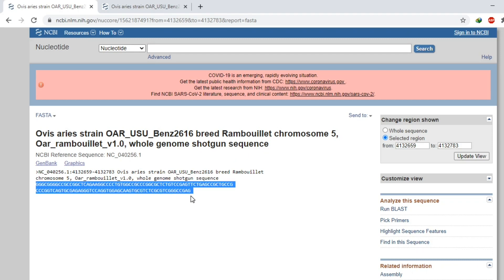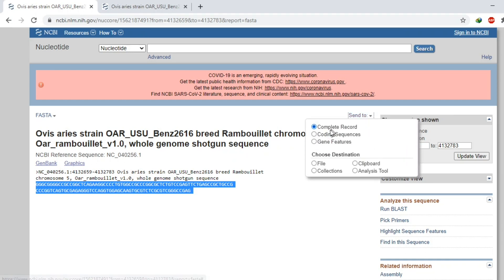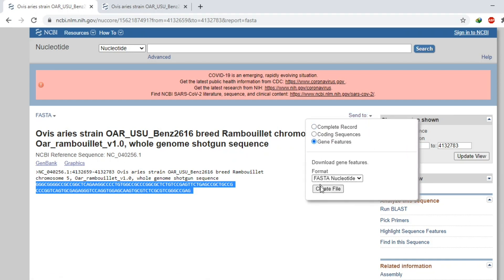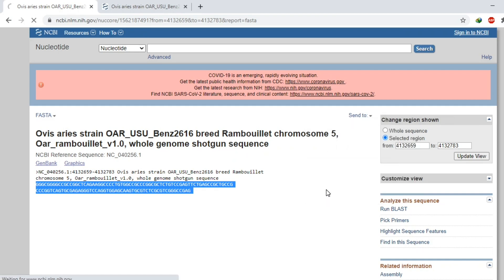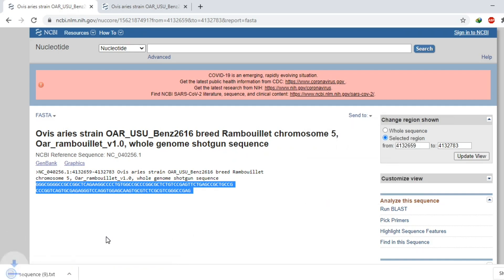You can simply copy this sequence and paste it into a Word file, or you can repeat the same procedure I showed earlier: click on 'Send to', then 'Gene Features', select FASTA nucleotide, click 'Create File', and your file will be downloaded.